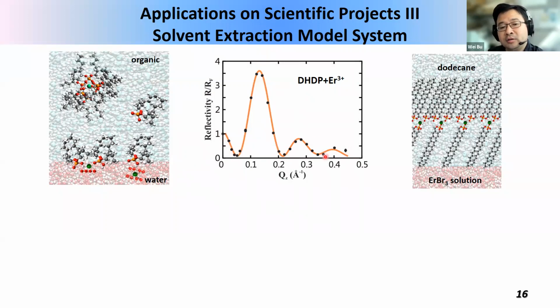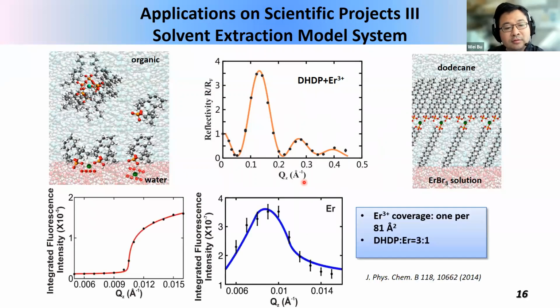It probably looks familiar to you because we did the X-ray reflectivity analysis on this data yesterday. And it turns out it has a bilayer structure like this. We do expect some metal ions in this structure, but with X-ray reflectivity alone, we do not have direct evidence. So what we did is we did X-ray fluorescence on this system. So first of all, we did XFNTR for the reference sample, so we can get a scale factor.